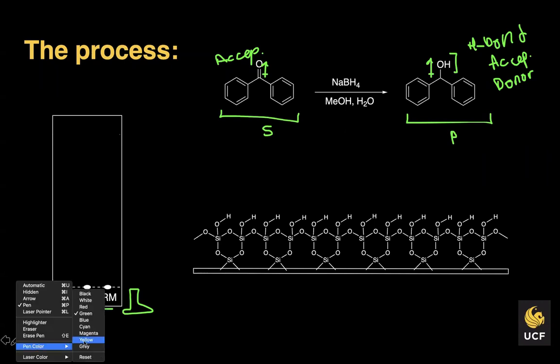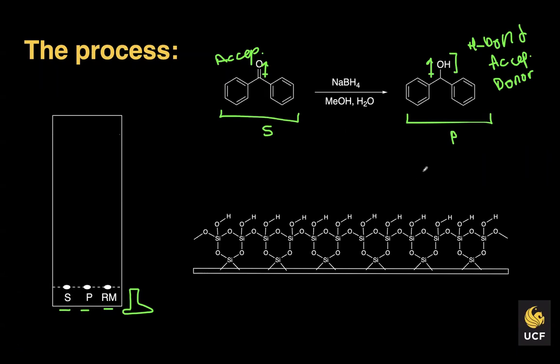There is a type of separation called reverse phase, where we are looking to separate nonpolar things by columns that are high affinity to nonpolar compounds. So it is relative to what you're doing. TLC is primarily used for normal phase separation and therefore will always favor holding on to a polar compound.